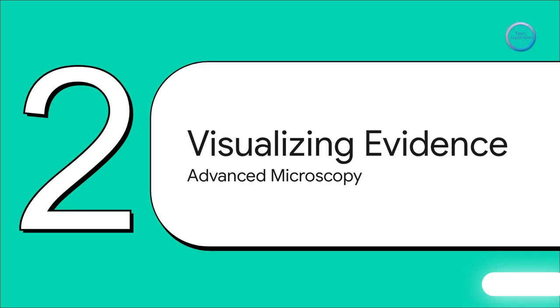Let's move into our second section here, visualizing the evidence. We're opening up that detective's toolkit, and it sounds like the first tools are these electron microscopes. Where does a scientist usually start when they just want to see what they've made? The first stop for pretty much any nanoscientist is the Scanning Electron Microscope, or SEM. If you just want to know what your sample looks like on the surface, SEM is your go-to. Its main job is to give you these incredibly detailed, almost 3D-looking images of a sample's topography.